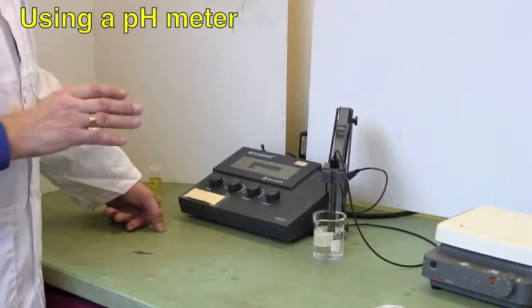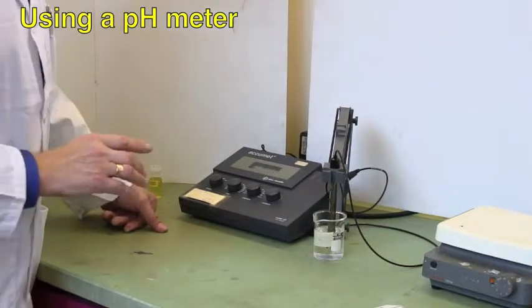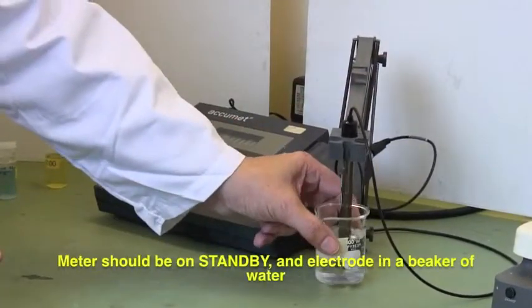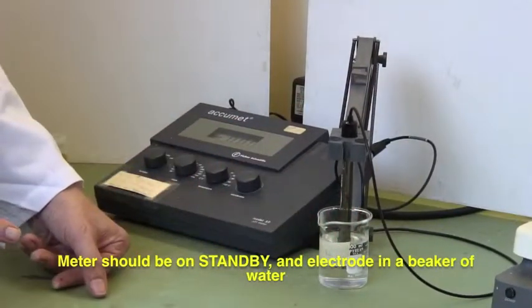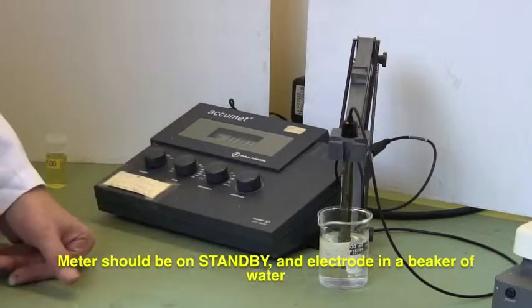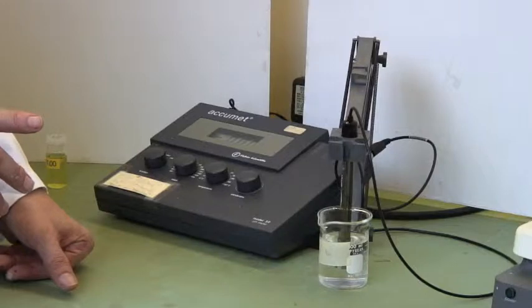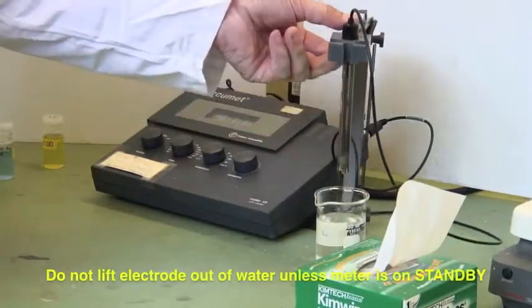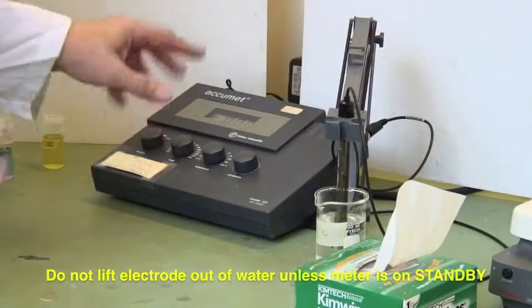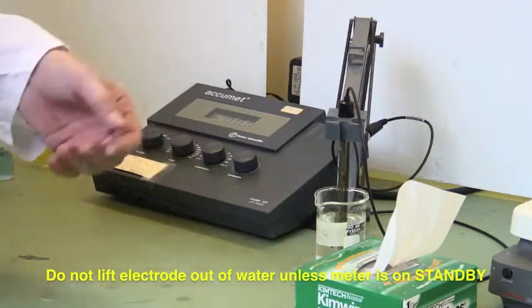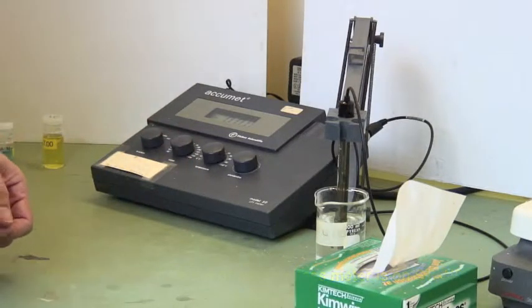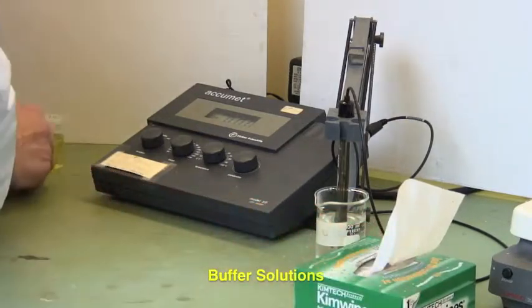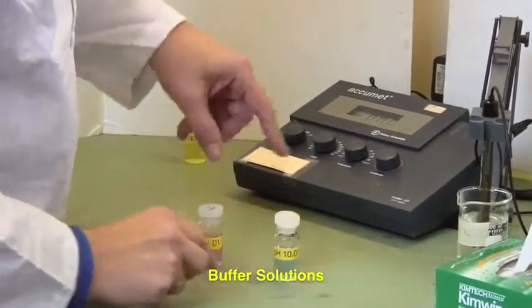This is a pH meter and how to use it. At the moment, it's set on standby, meaning it's shorted out. The electrode has been sitting in distilled water since last use. Don't lift the electrode out of liquid unless it's on standby, or you'll polarize it and get peculiar results. We'll calibrate the machine using buffer solutions.